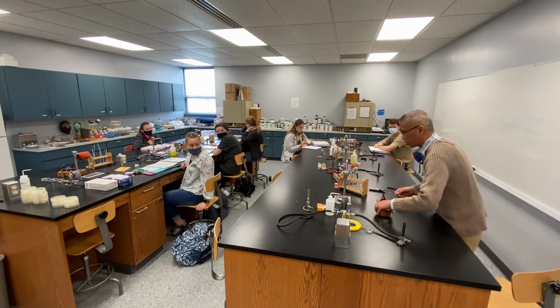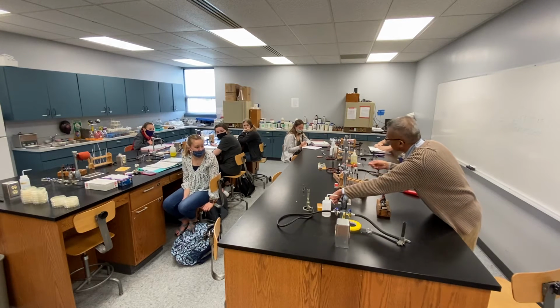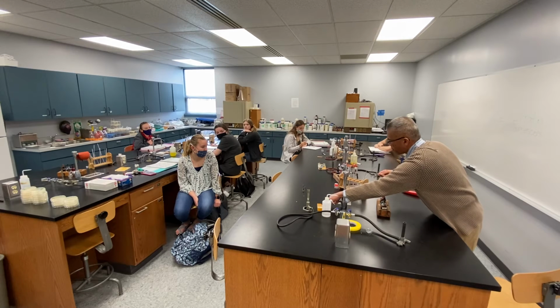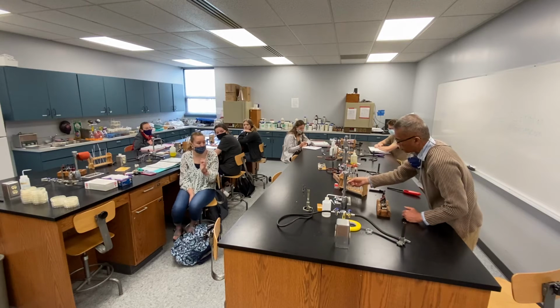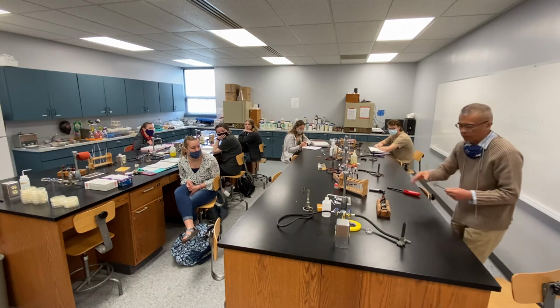And this step is also very critical. Remember, don't wash this with too much force. So if you wash like this, all the cells will be gone, right? Yes, make sure you have a slow, gentle flowing of water or dripping. Yeah, this will be safe. You have to wash it like this. You can wash the dye down to the sink, so it'll be okay. And keep it running, so it's okay.